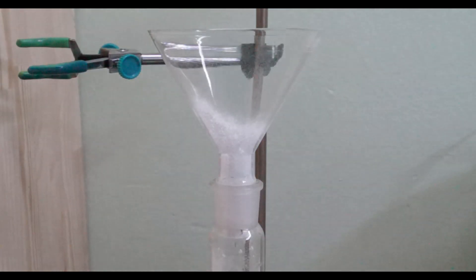I washed the beaker that contained the calcium chloride and the addition funnel with the remaining 300 milliliters of hydrochloric acid.